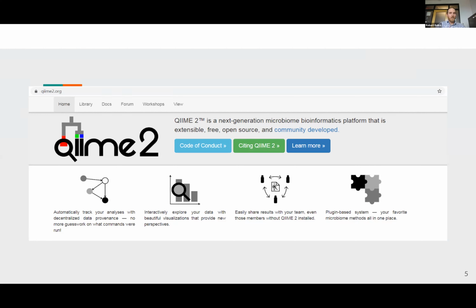Great. Awesome. So the QIIME 2 software suite is a series of analytical tools for microbiome analysis, particularly with 16S. And so it can do everything from load in your raw sequences, do quality control, demultiplex your sequences, diversity analysis, taxonomic classification. It hooks into things like MUSCLE, RAxML, FastTree, or IQ-TREE for phylogenetic analysis. Has all sorts of nice visualizations as well, statistics, machine learning.